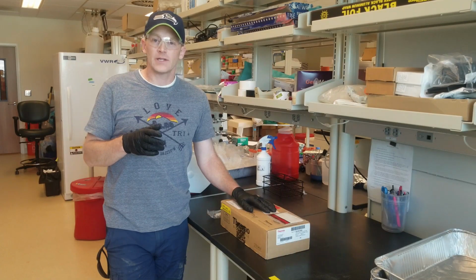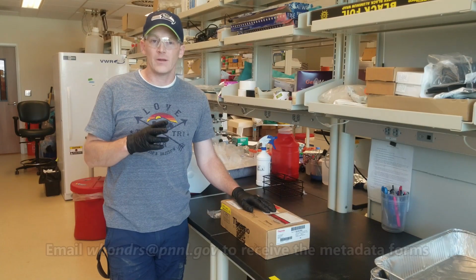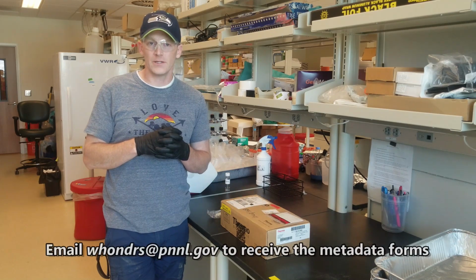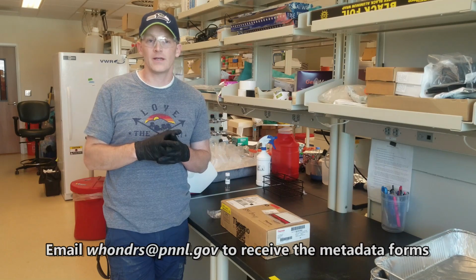The other thing to do is to make sure you've uploaded your metadata. That'll be in two forms. One will be a form associated with uploading your pictures, and the other will be a spreadsheet that contains the actual data.